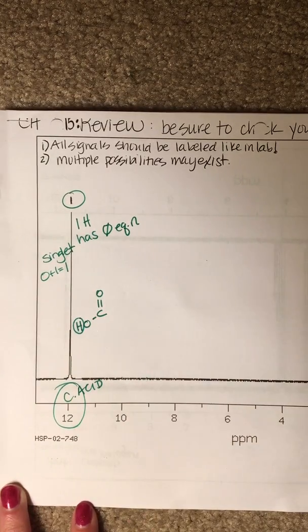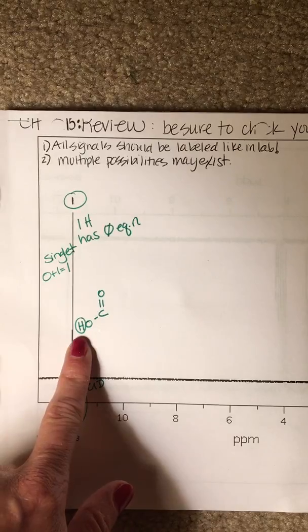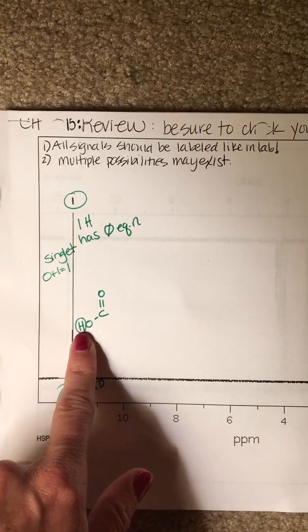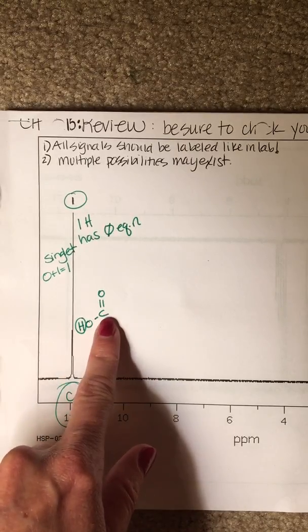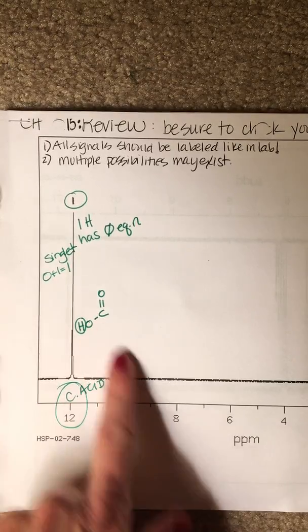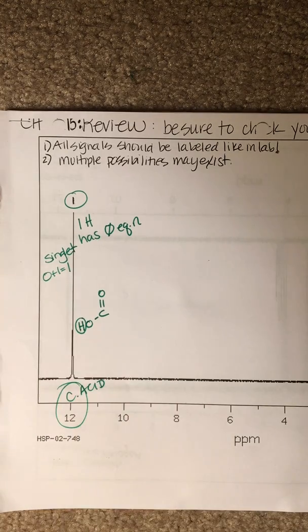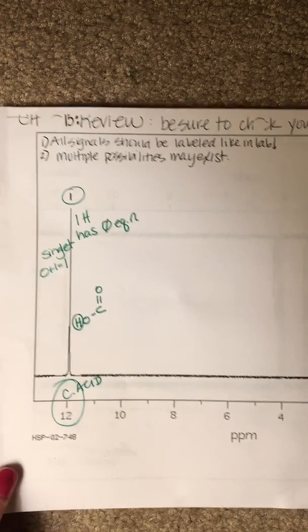This little hydrogen right here, that's his signal. He's super de-shielded. If we look at the adjacent atom to which it's attached, this carbon, there's no hydrogens that are going to be on here. Okay, and this certainly wouldn't be an aldehyde. There's no 9 to 10 there. So he has no neighbors. We already have a piece of our puzzle.